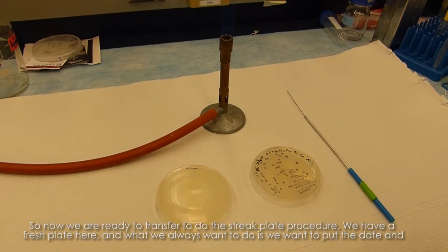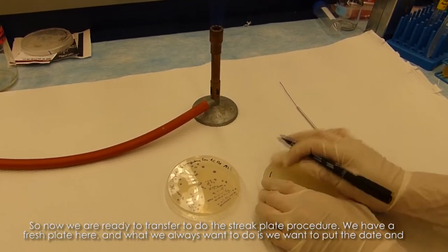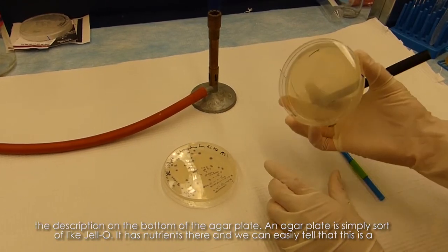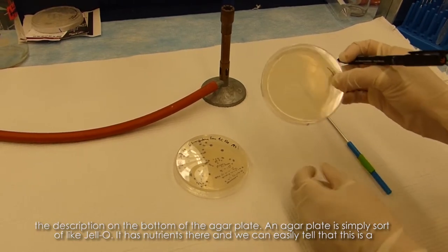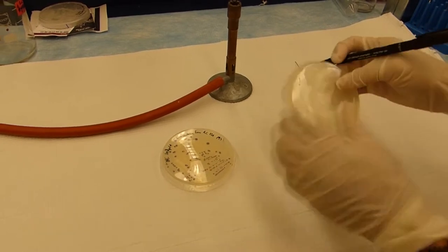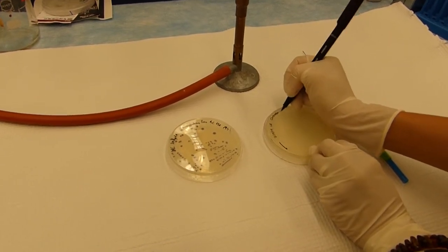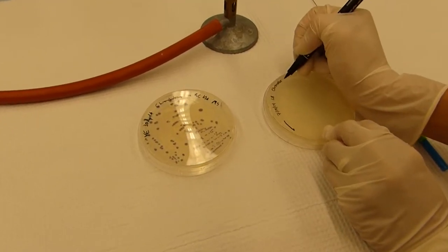Now we're ready to do the streak plate procedure. We have a fresh plate here, and we always want to put the date and description on the bottom of the agar plate. An agar plate is sort of like jello — it has nutrients in it. We can easily tell this is a sterile plate because there's no bacteria growing on it, in contrast to the plate we're transferring from. We always label on the bottom because the lids can get switched. Also, make sure the plate is dry before use.